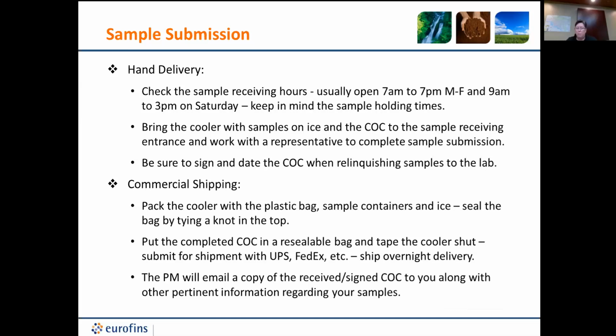Okay, commercial shipping, right where we were. We want to make sure it's tied in a knot, taped off, complete the COC. Once we get the stuff here, the PM will email you a copy of the received and signed COC to you along with other pertinent information regarding your samples. You'll get a sample login acknowledgement. It'll say we received your samples.